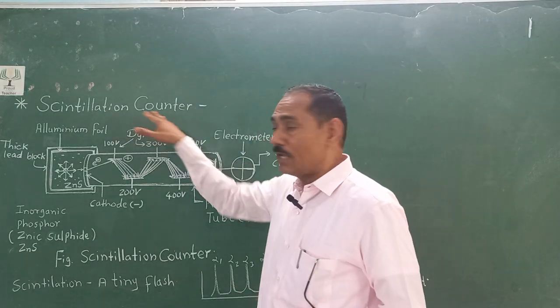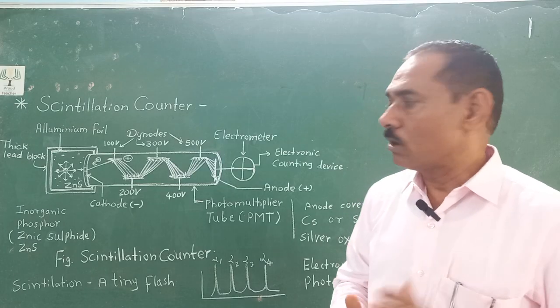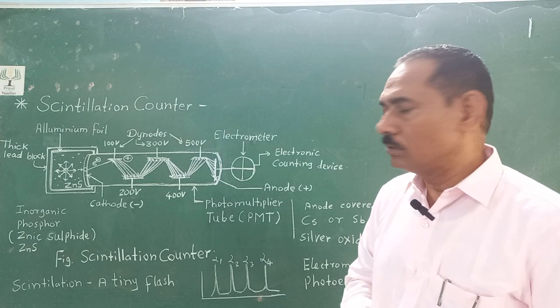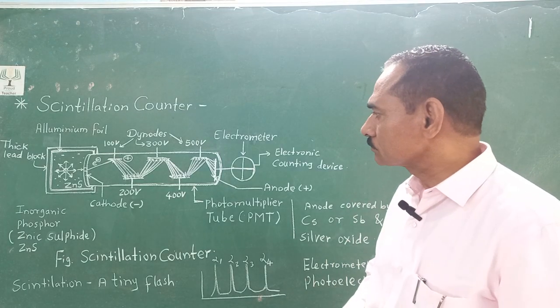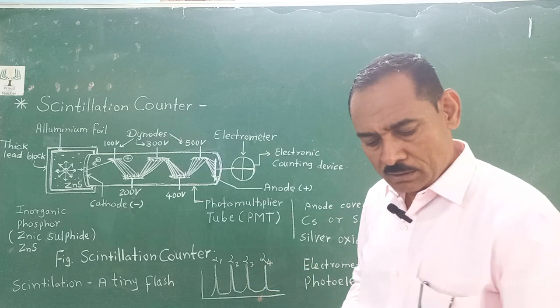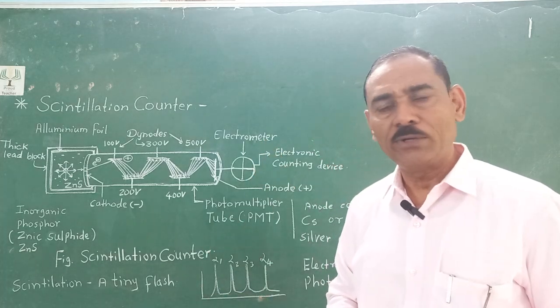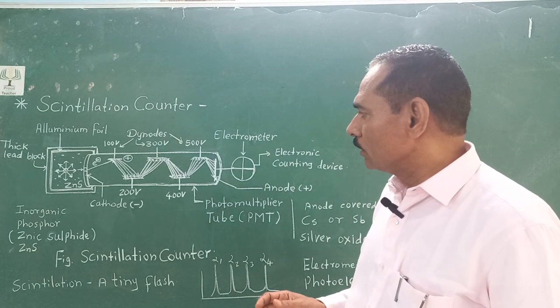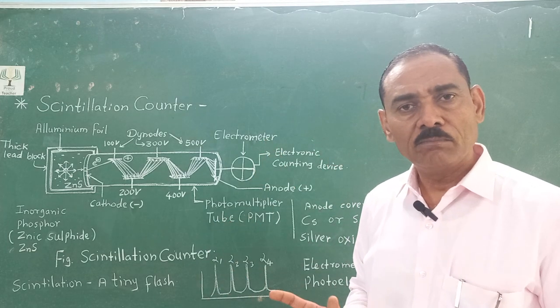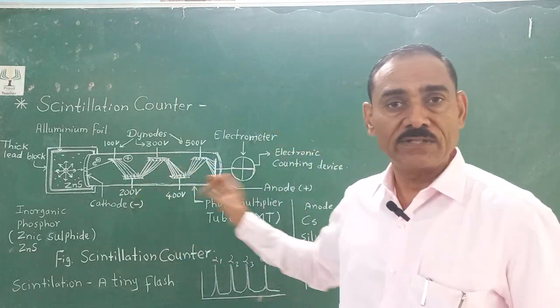Now, a scintillation counter is a cylindrical instrument, in which the interior core is seen like this.